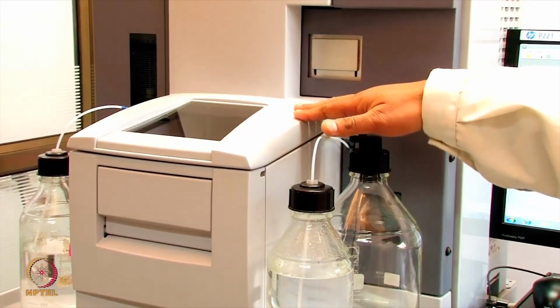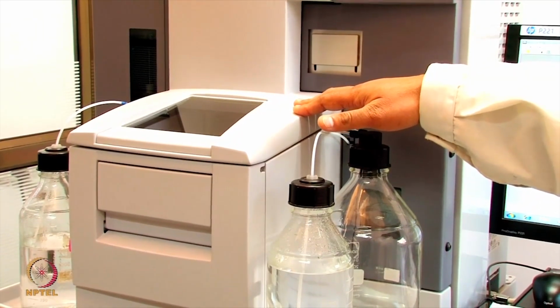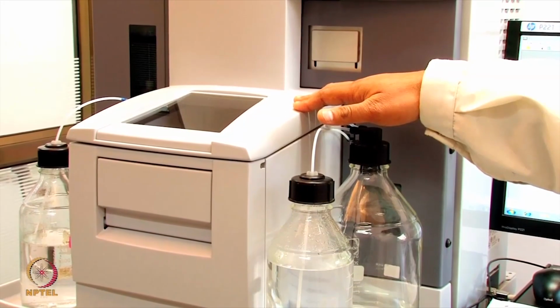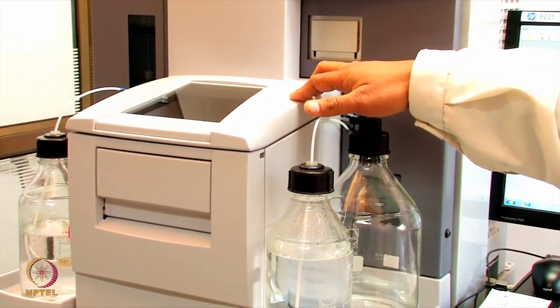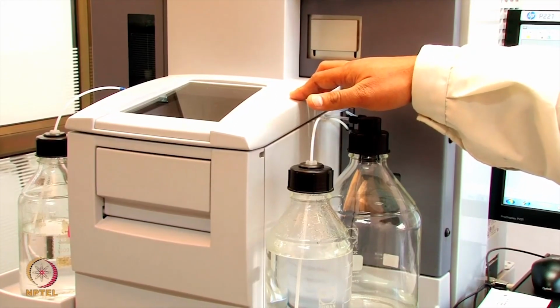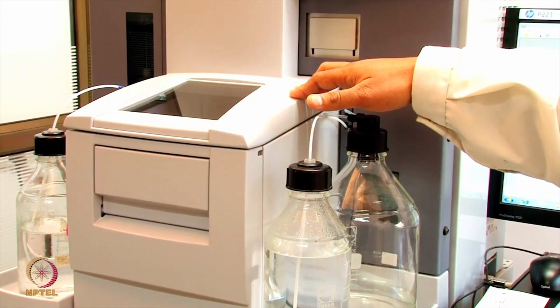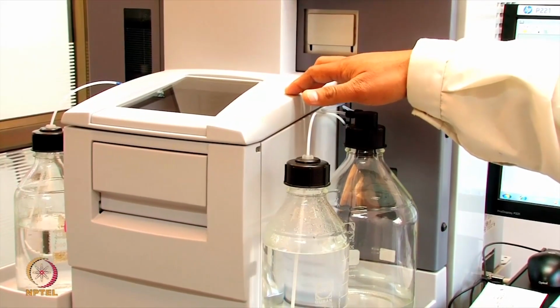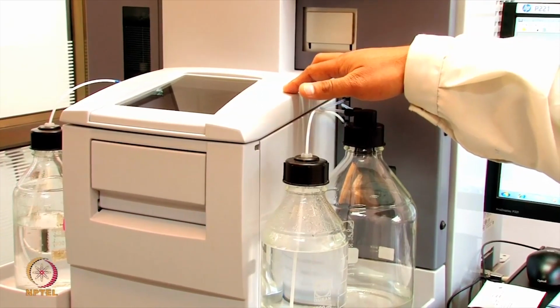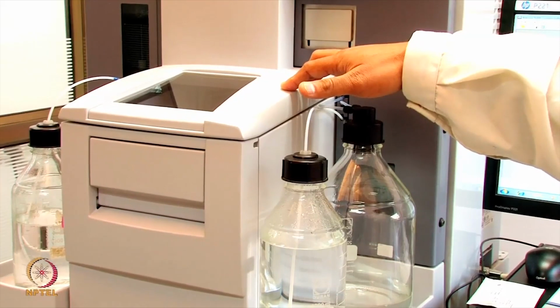Generally, in any biochemical experiments, buffer should be connected and equilibrated overnight, or if there is no time, a minimum of 3 hours of equilibration is essential. Otherwise, when you start a new experiment, do at least 6 primes on the system.